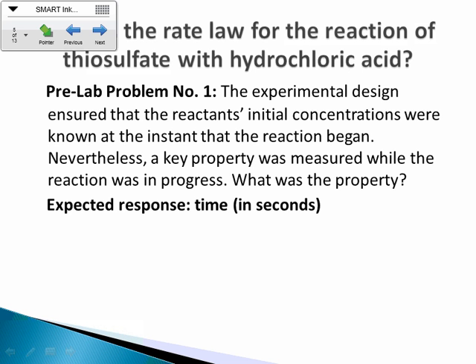Oh, never mind. I take it back. I guess we can't say we were measuring that necessarily because it's qualitative. We're using that, but we're measuring the time, okay? So we're going to use the time to change it into rate, essentially.